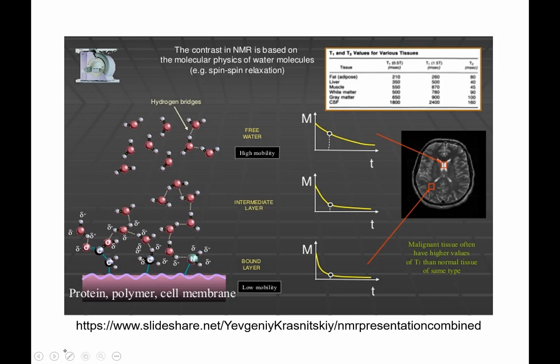And there's a time factor. In our system, when the nuclei go up into the excited state, they give off their energy to the oxygen involved. If I remove all the oxygen from the system, they relax incredibly slowly because there's nothing for them to give their energy to. So you can measure that time.